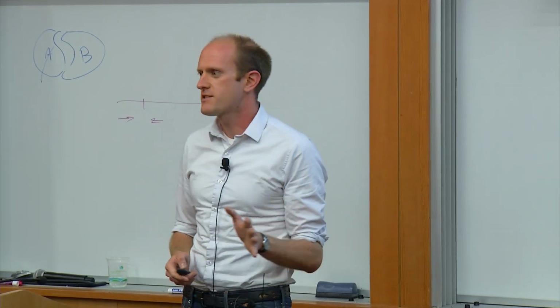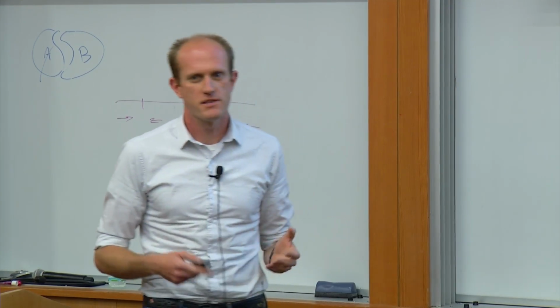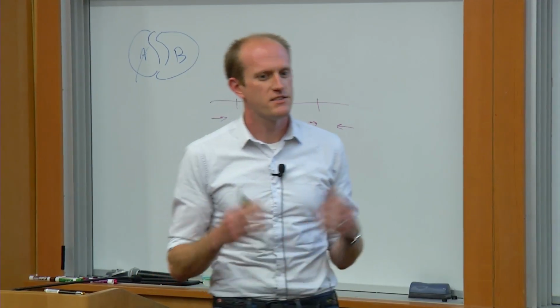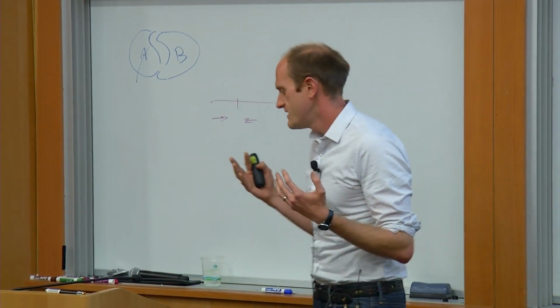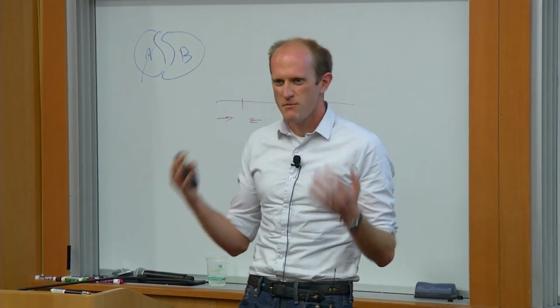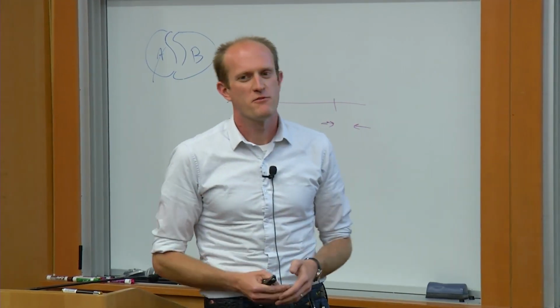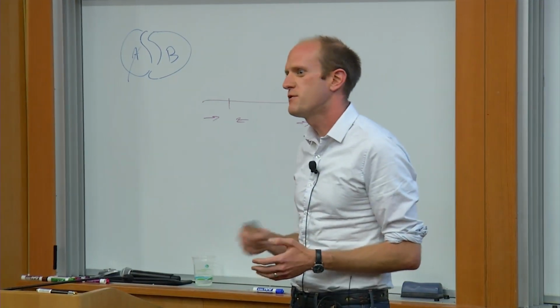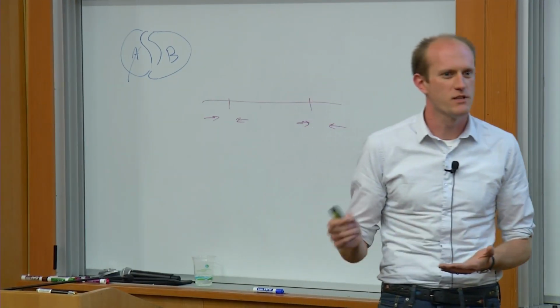You don't want to treat these things as a black box. And I'm going to focus a little bit on some of the questions that people might have for using these, and try to really demystify the whole thing. I mean, it's called bioinformatics, and sometimes people who are not bioinformaticians see that and get a little bit scared. Bioinformatics is really just stuff that you would do yourself, that you could write down on a piece of paper. It's just done really, really fast, right?